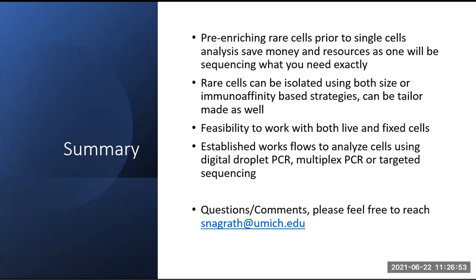I hope I have shown the feasibility that we could work with live cells or fixed cells. The example that I showed was with fixed cells, but we are able to do both live cells and fixed cells using this labyrinth and DEPArray workflow. And we have established the workflows to analyze these rare cell populations. I have shown an example of circulating tumor cells, but we can do this for any specific subtype of T cells or NK cells or macrophages.